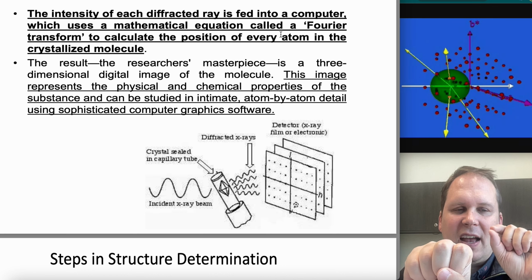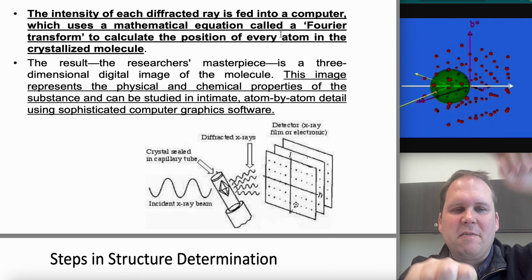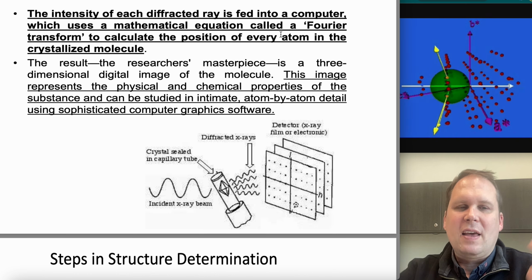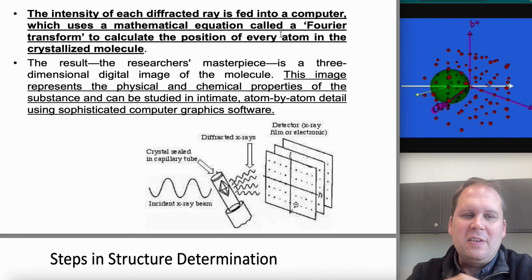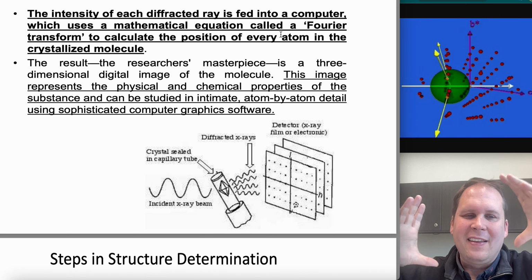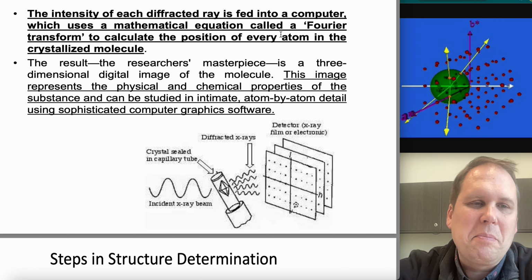And little tiny changes, like the position of a single atom, will be very far out from the center. So you kind of draw a circle around where your good data is, and then you figure out what's the last shell, circle, in which you have data, and how complete is that data.